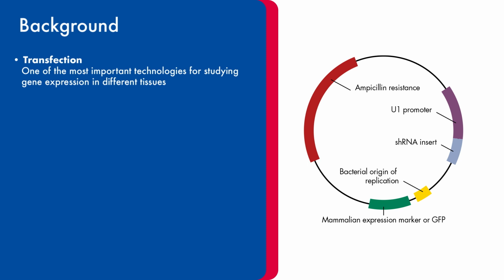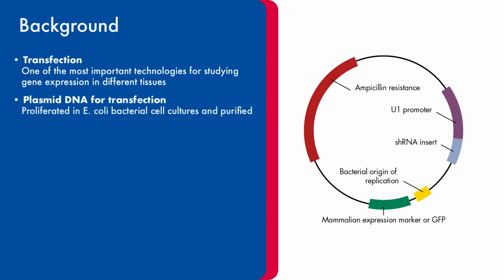Transfection of eukaryotic cells is one of the most important technologies for studying gene expression in different tissues. Cells or cell lines of the tissue of interest are transfected with a certain gene or part of the gene. The gene of interest is most commonly cloned in a vector, and the resulting construct is proliferated in E.